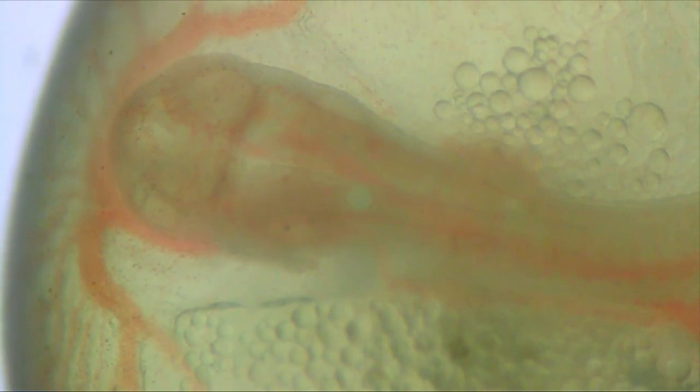In this view you can see the tiny blood vessels in the head, and the blood flowing through each one in single file.